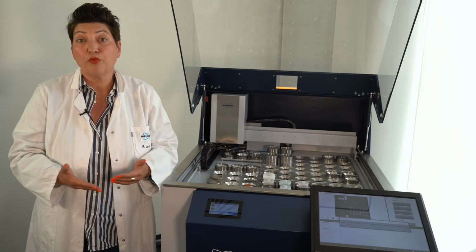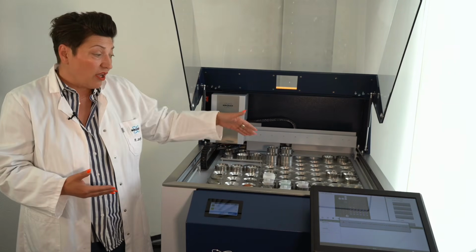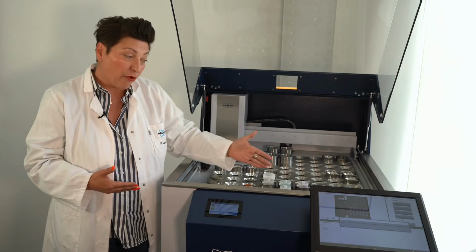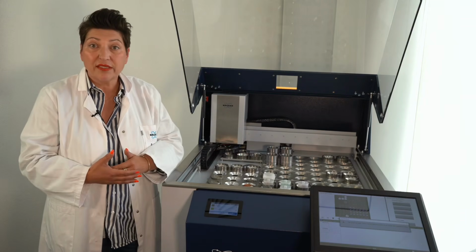Both methods are, of course, usable for liquids, and they do not exceed 20 minutes measurement time to make sure that the foil is not stressed too much by the radiation. With the new loader, we also have the possibility to define, for example, areas where only liquid samples are started. You can also have areas, for example, where only solid samples are started.